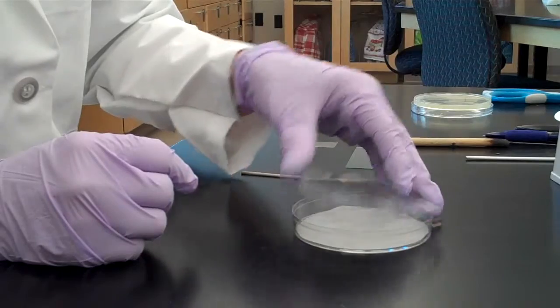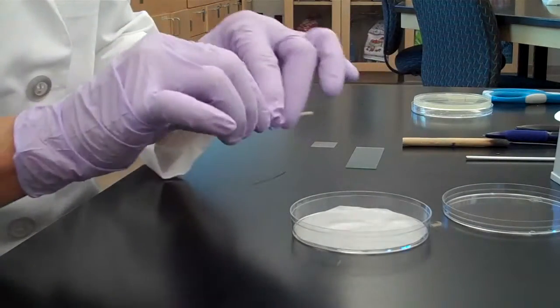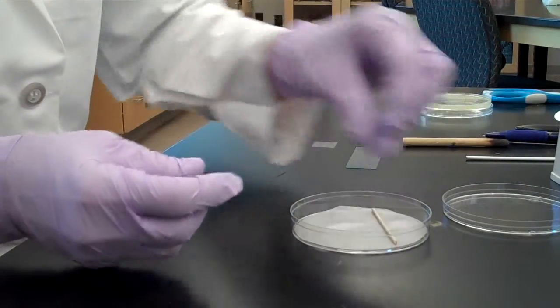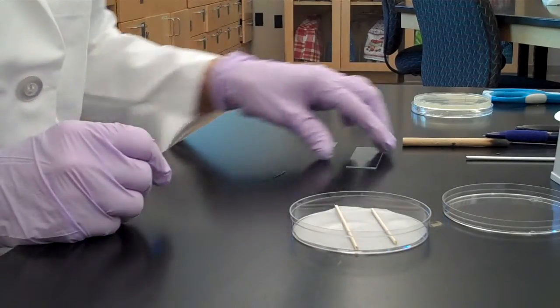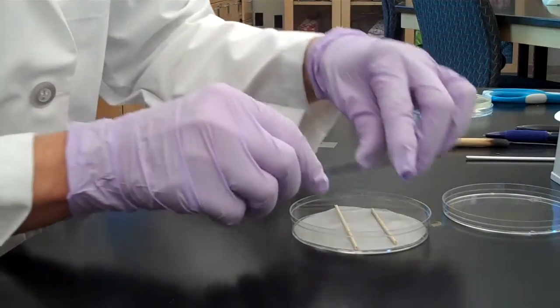Take a wooden applicator stick and break it in half and place the sticks into the petri dish. This is going to serve as a support system for our slide, so go ahead and put your slide on top of your broken sticks.